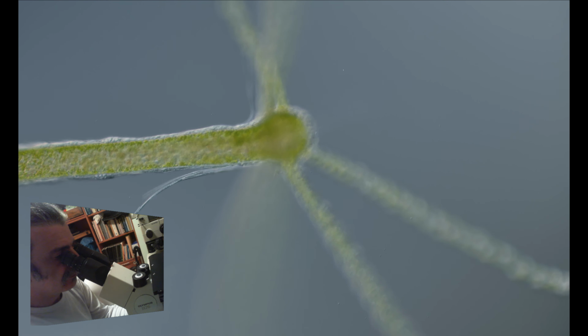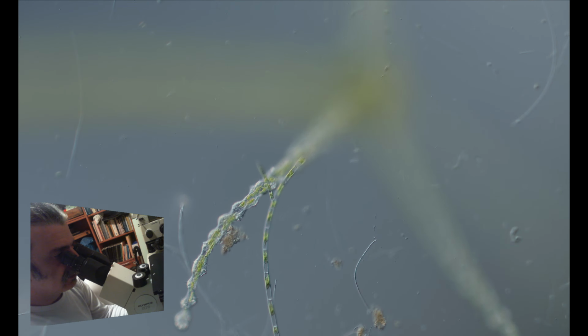Hydra. Sometimes there are even ciliates that live on the hydra tentacles.